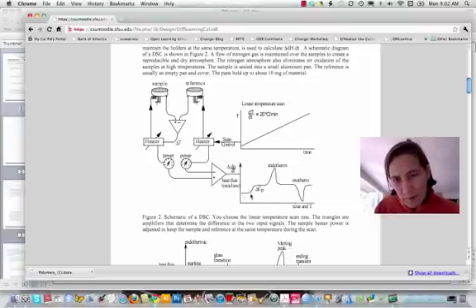So this deviation from a line indicates that in this case more heat is required to flow into the sample in order to keep the temperature equivalent to the reference. So this kind of bump right here indicates a change in heat capacity, or the delta H per delta T.